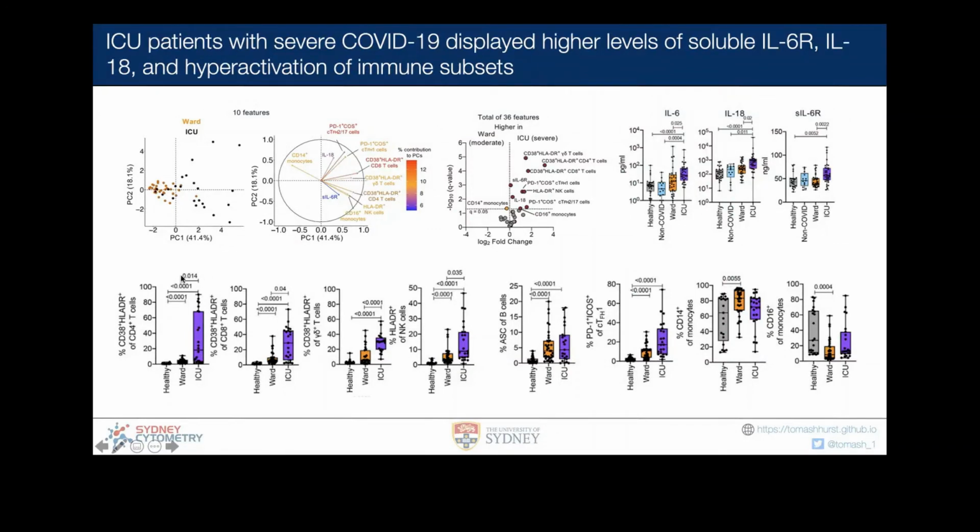So this was quite good in terms of demonstrating what we can do. Some of this was not necessarily just doing clustering, but the ability to take either data we've clustered or data that we've gated and rapidly generate a lot of these summary statistics all in a single workflow, which gets us to this answer very quickly.